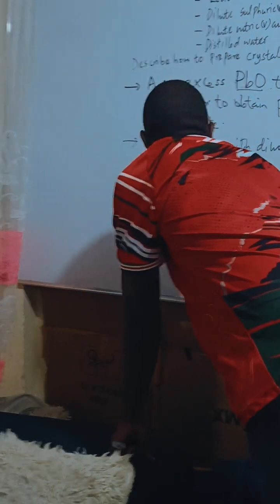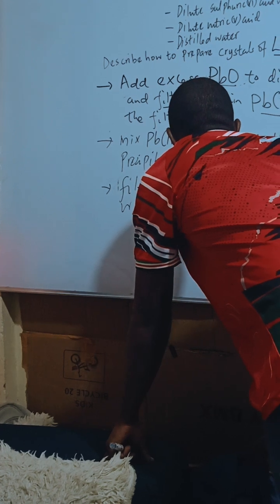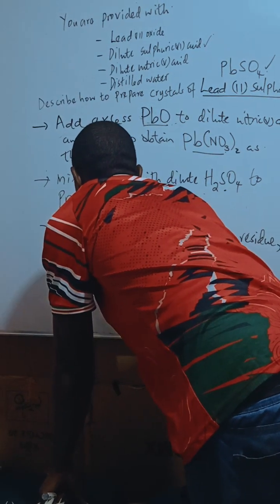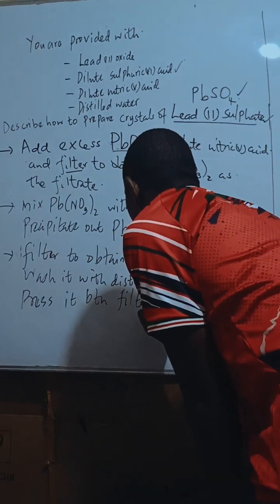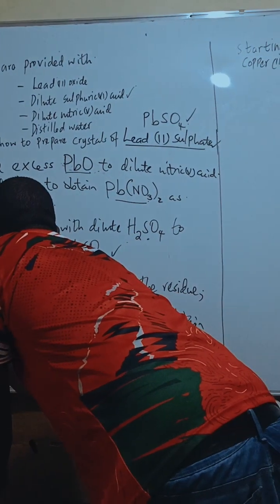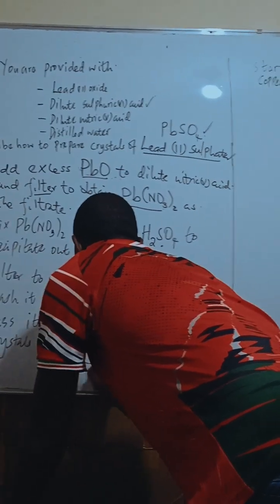Then after that, wash it with distilled water and press it between filter papers to obtain crystals of lead sulfate. So that is our salt.